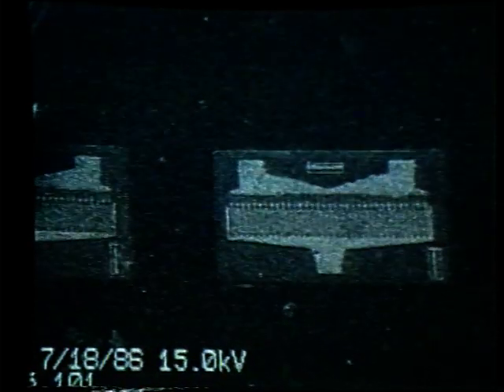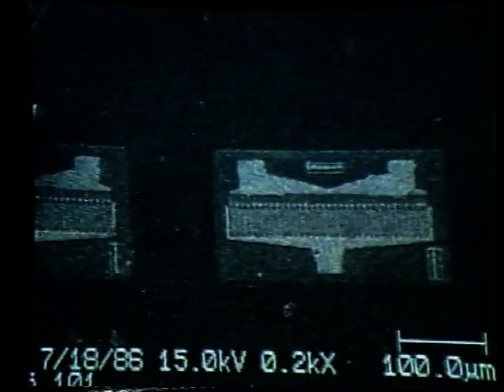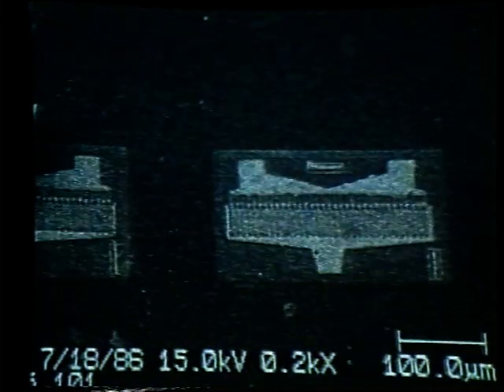To demonstrate how the photo will look, we can go to our TV monitor. I have toggled all of the fields off so that I can demonstrate how they look when we toggle them on. We will be able to see them superimposed on our live TV image. Going back to function key number 1 and the date, I will now toggle the date on. Function key number 2 toggles the photo number on. Function key number 4, the kilovolts. Function key number 5, the magnification. Function key number 6, the micron marker. And function key number 7, the comments.